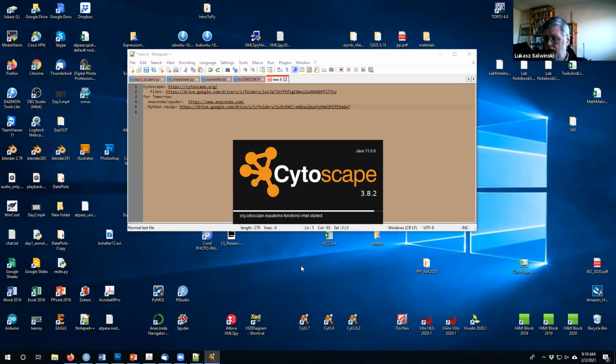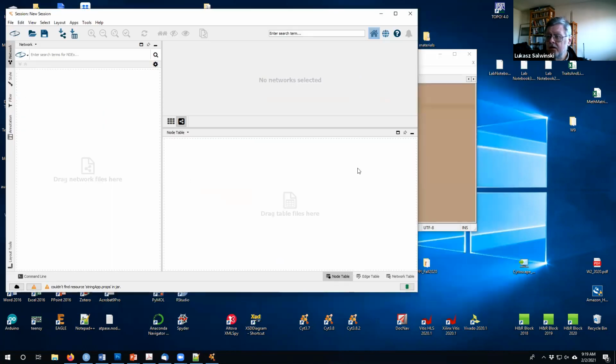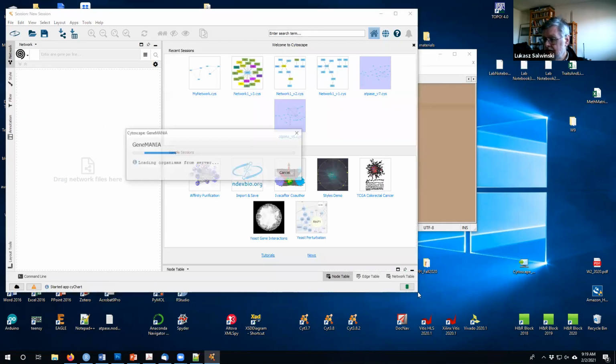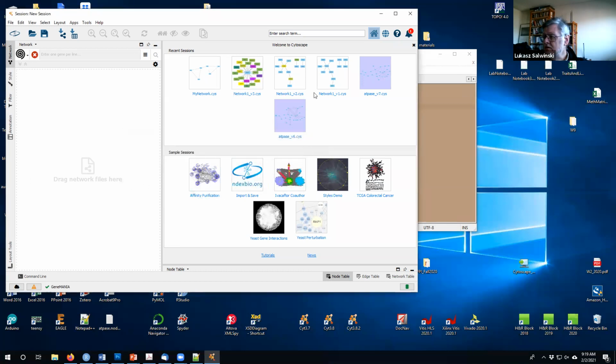Okay, here we go. And here's the initial startup screen. It's doing something strange. Okay, it's initializing. The first time you run it is going to take more time because it's trying to initialize things, get things in from the... Oh, those two slides.